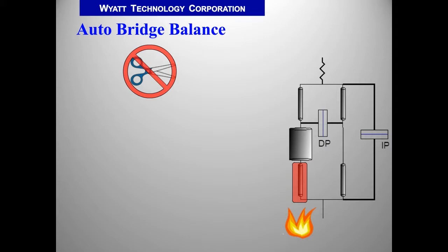So what we do is we hold all of the capillaries, except for the lower left one, in a thermally controlled spool at 1 temperature, and we change the temperature of the last arm of the capillary. That's shown schematically with this little fire icon. Of course, we can heat and cool. The nice thing about doing this is that the sample does not go through this capillary.